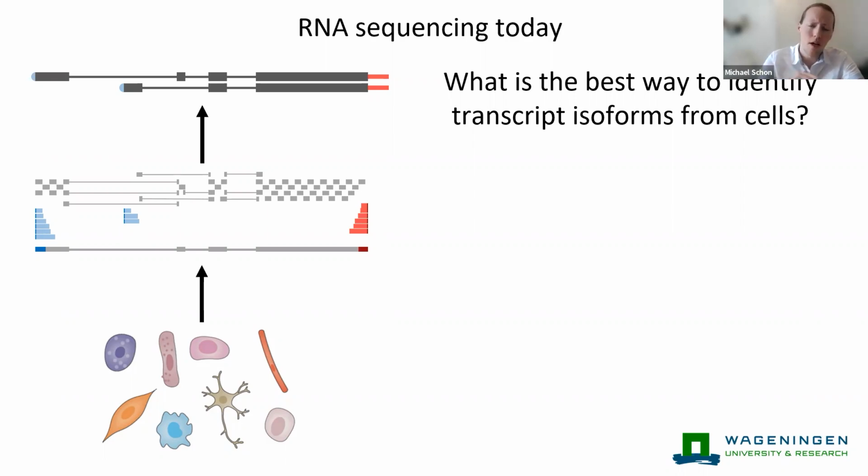And so in order to think about how to best identify transcript isoforms from cells, I was specifically interested in three different aspects.